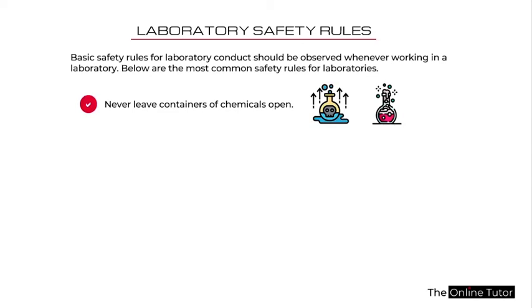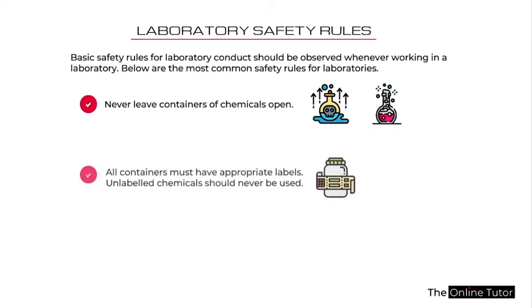Now, never leave containers of chemicals open. Never do that when you're in the laboratory. Once you are done taking an aliquot of the substance that you've prepared, or the acid or the base or any chemical that you're using in the laboratory, make sure you close it back. Don't leave it open, because these chemicals emit gases. They may react with another gas that is also around, and it may be toxic to you. So once you are done taking an aliquot of your sample, make sure you close all the containers and don't leave them open to emit the gases that they contain.